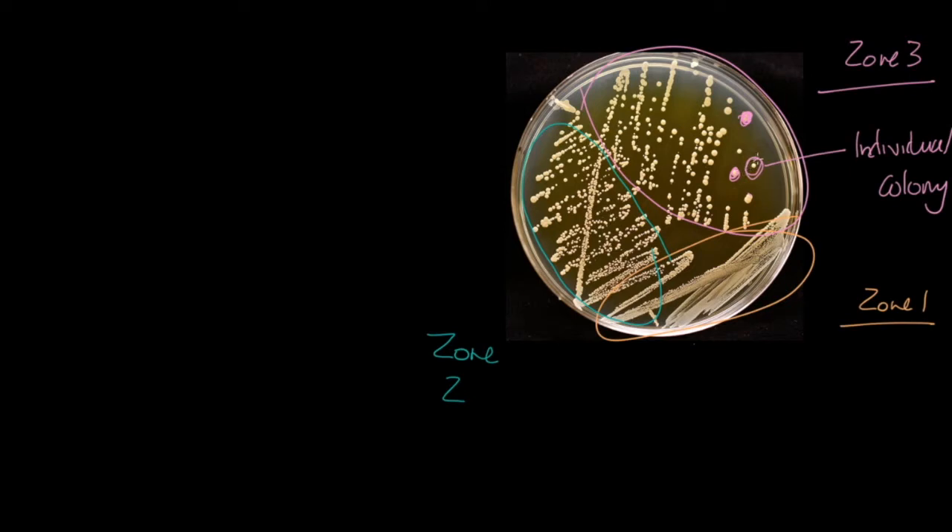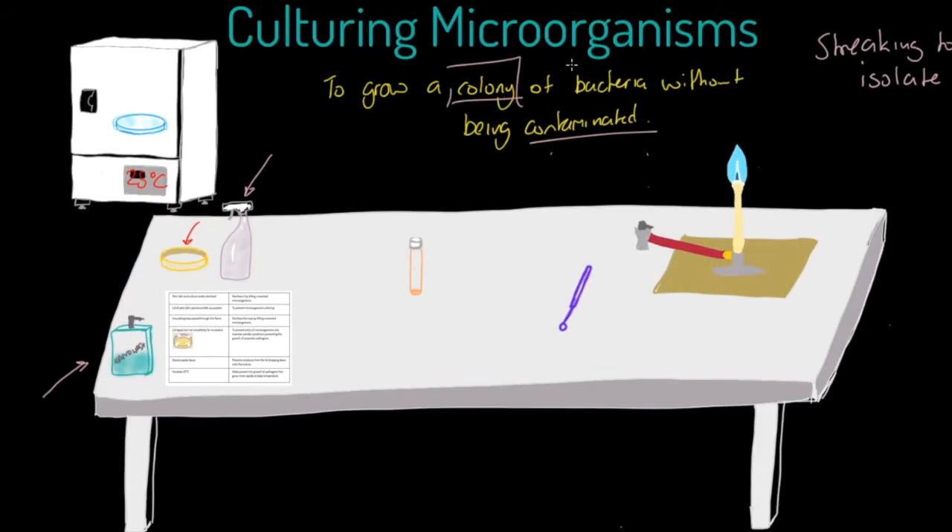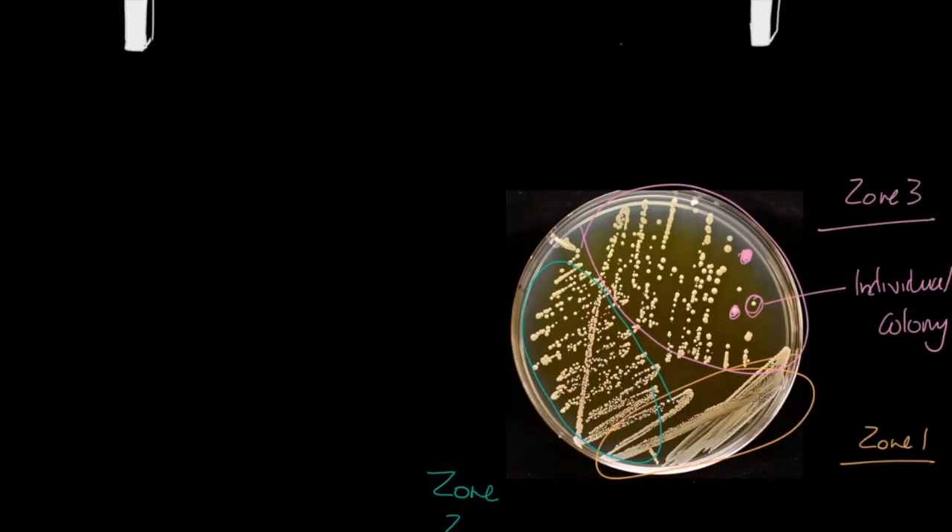That individual colony has grown from one single bacterium, which has divided through binary fission to produce the colony. If you get bacteria with a completely different morphology — different shape, colour, or structure — it means the plate has become contaminated. Consistent colony appearance means no contamination; varied morphology is evidence of contamination.